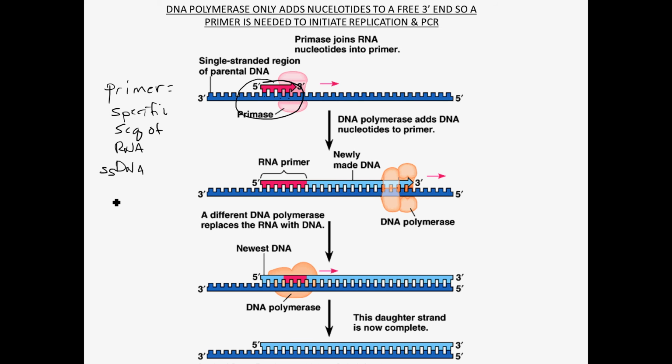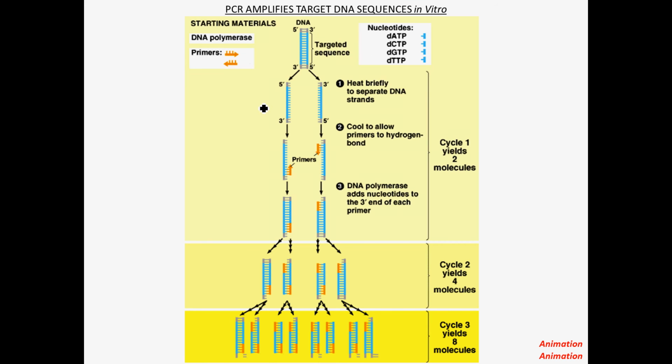So this primer that we're going to use in PCR is of a known sequence. Those primers are described as being specific, right? And when the primers bind to the DNA, we say that the primers are annealing. Annealing is also what they really mean here, that those primers are going to hydrogen bond, right? So again, we're going to see this annealing, hydrogen bonding, the binding of the primers to a specific DNA sequence. Okay? So again, this PCR is based on something that's normally naturally happening in cells, and that is the DNA replication. So here we go for the PCR.